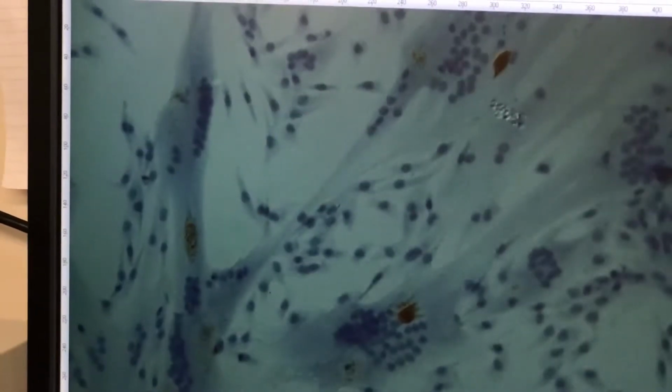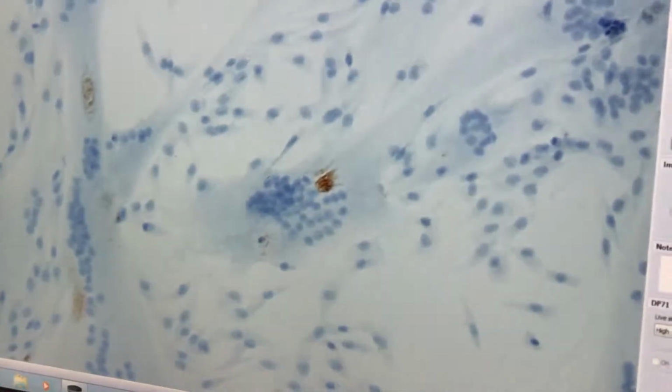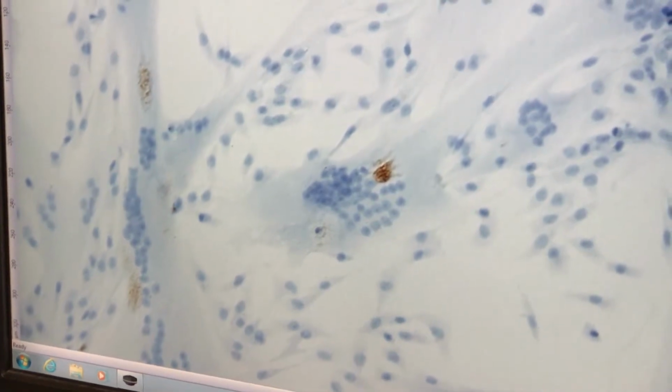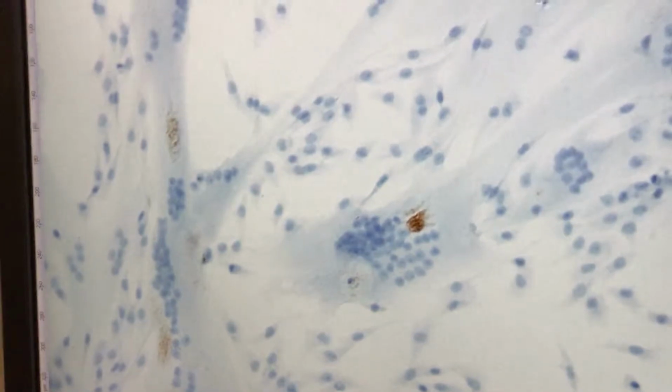You can see that this is clearer. DUX4, wow. So they always tend to conglomerate together. They always come together, don't they? They're not just dispersed. They tend to come together. So we can say that it's a normal thing that we could see.